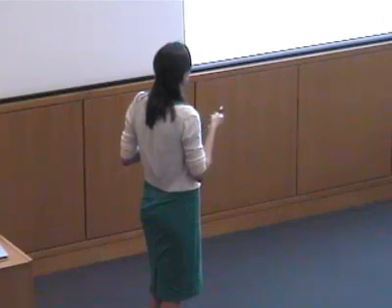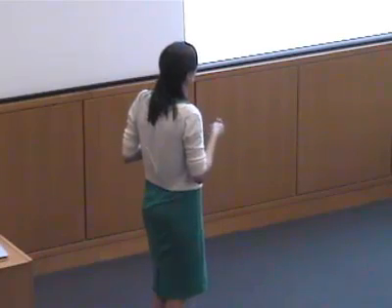Okay? And this has been applied by Vera Krewald to real complexes, where she's looked at manganese complexes with 2 oxos, an oxo and a hydroxo, and 2 hydroxos. And what you see are these very clear shifts that allow you to actually distinguish. And this, in principle, can be very helpful when you're trying to distinguish different intermediate species.